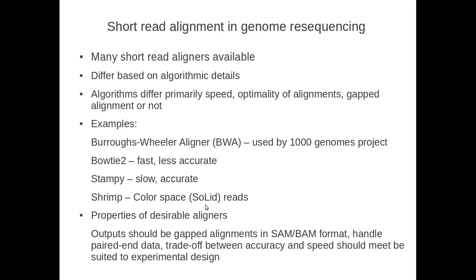The properties of desirable aligners: at this point, all aligners really that are worth their salt output gapped alignments, that contain insertions and deletions. These alignments should be in SAM or BAM. They should handle paired end data, and they really should be optimally suited for your needs.